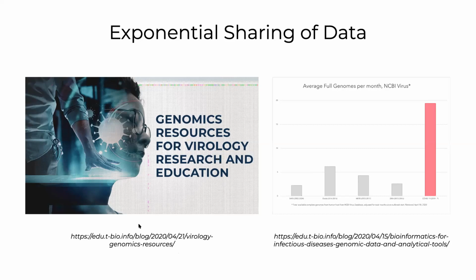Okay, so can a consensus genome be a reference genome? Well, a reference genome is going to become a reference genome after it is validated. There are a number of different technologies that are used to really validate. As we talked about the way that next generation sequencing has evolved, that also made a number of different technologies compete with each other. And they provide different types of information because of the way that they generate those sequences.